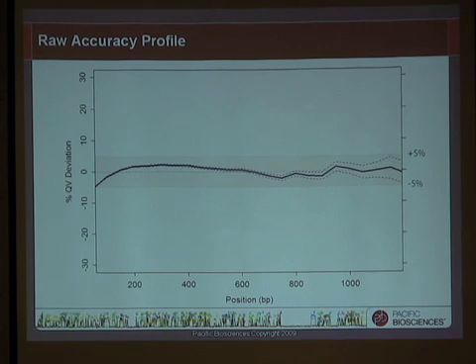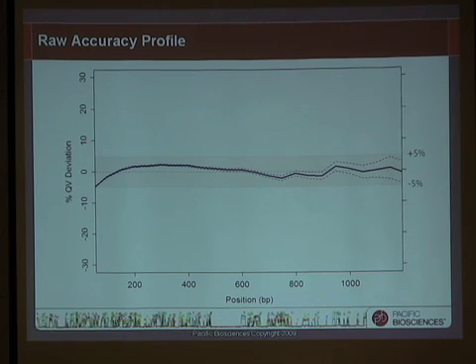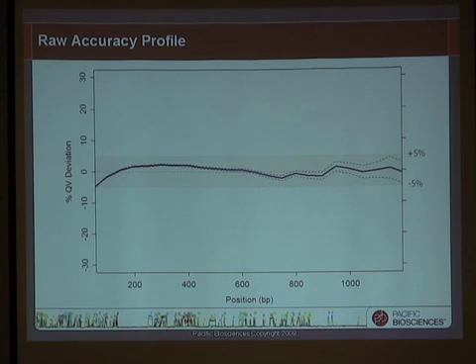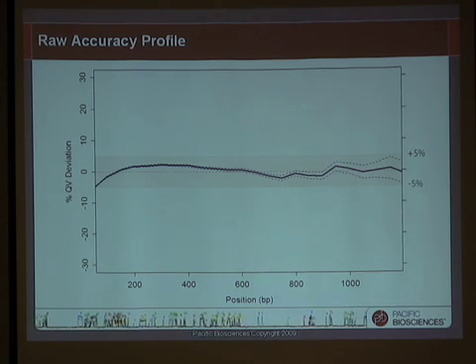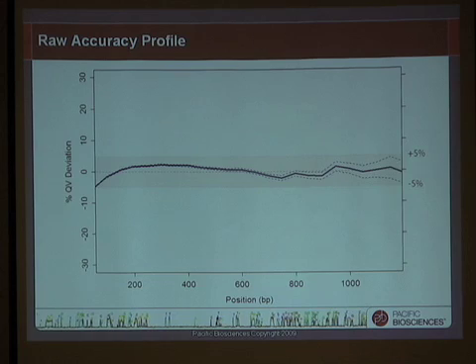And also the accuracy within a read is uniform. This makes sense. In the animation I showed you before, I said I'd get back to that. Because the system, after the cleavage of each nucleotide, is returned to exactly the same condition that it was in before, there's no reason to believe that the accuracy of the first base incorporated would be any different from the accuracy of the last base incorporated. We're very gratified to see in our E. coli data that that's true. This is a 1,200 base window, and the accuracy varies by less than 5% coefficient of variation from the beginning to the end of each of those individual traces.